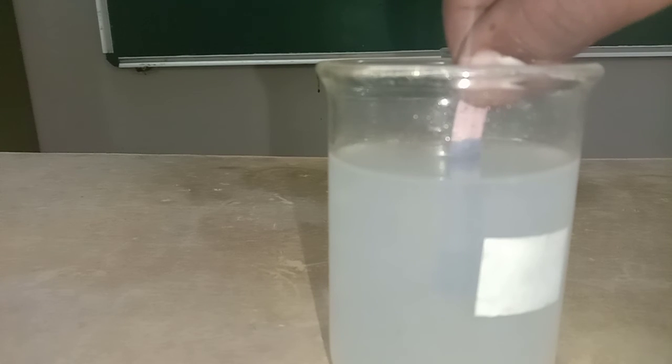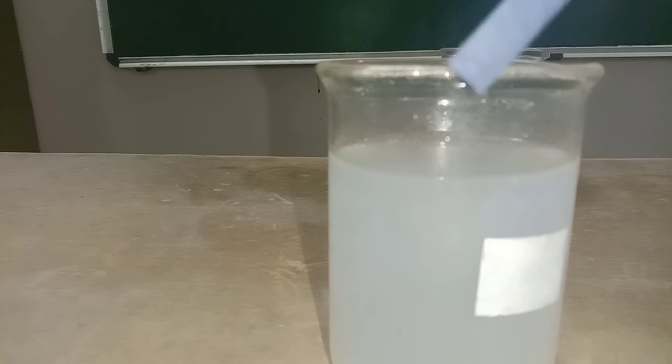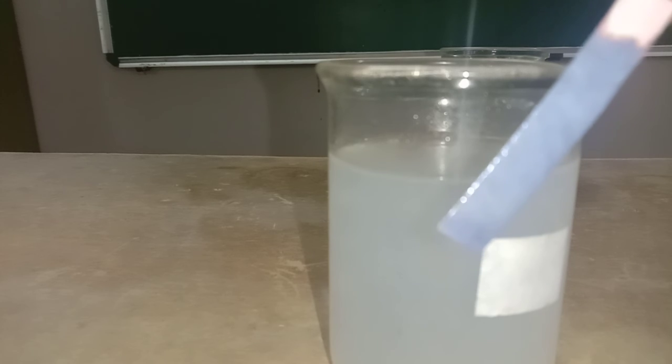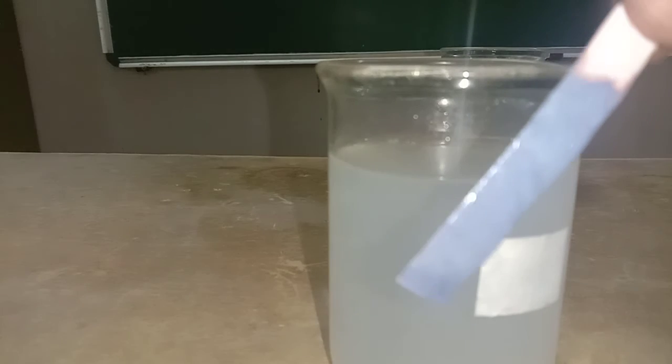I dipped the red litmus paper. You can see the change of the color. What is the color now? Before it was red, now it is blue. So the red litmus paper will change into blue color if it is a base. Suppose if it is an acid, it will remain the same color, red only.